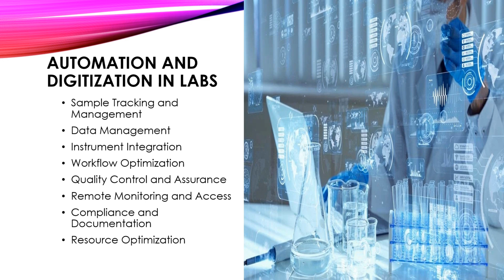Remote monitoring and access. Digital systems enable remote monitoring and access to laboratory data, allowing researchers to access information and perform analysis from anywhere with an internet connection. This capability is particularly valuable for collaborative research efforts and remote troubleshooting.